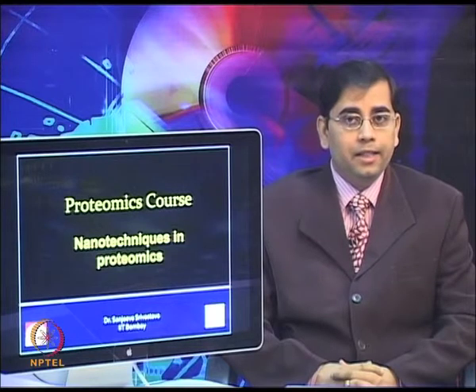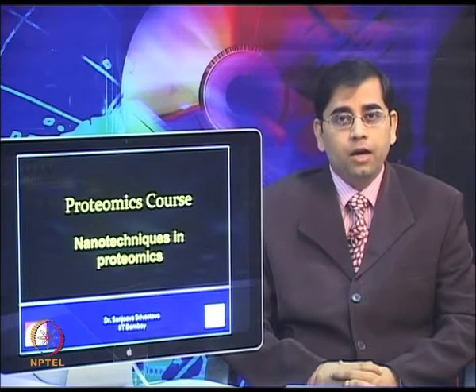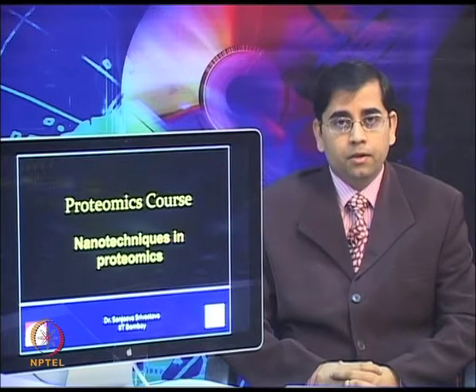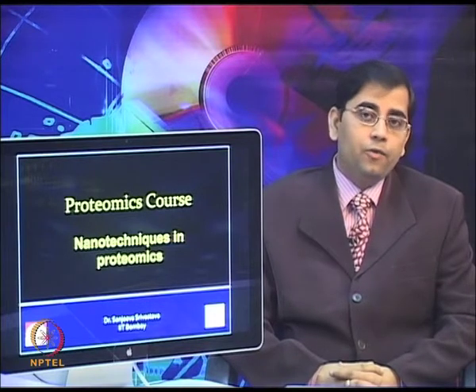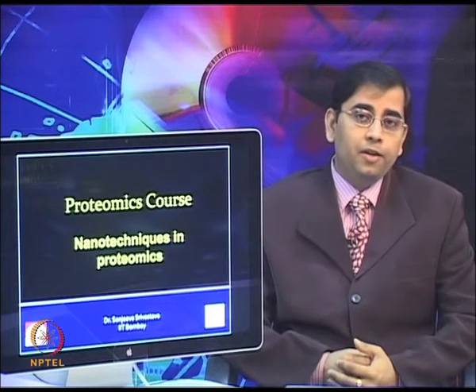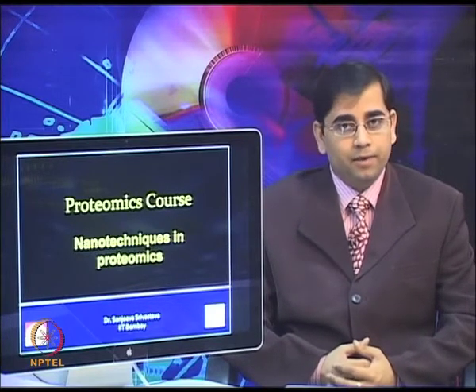In the same theme and continuation, today we will talk about different types of nanotechniques, and how they can be used for various proteomic applications. We will discuss their principle, and some of the advantages and disadvantages which each of these methods offers. And very briefly, we will touch upon how these nanotechniques are applied for proteomics based applications.